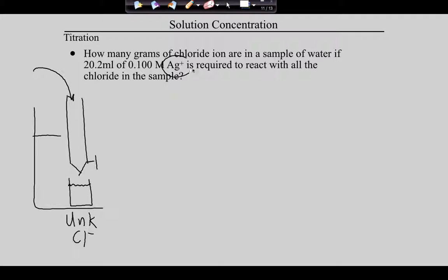Oh, silver ion. But guys, there's no such thing as silver ion solution. You can't make silver ion solution. If you have a piece of silver jewelry and huck it in water, it will never dissolve. So guys, where do we get silver ion solution? What could we use to make silver ion solution? Silver nitrate. Guys, what we actually are going to use is silver nitrate. The presence of the nitrate makes a salt which then dissolves in water, and now we have silver ion solution.